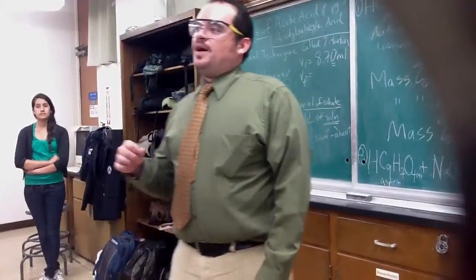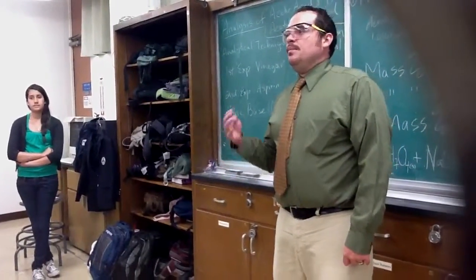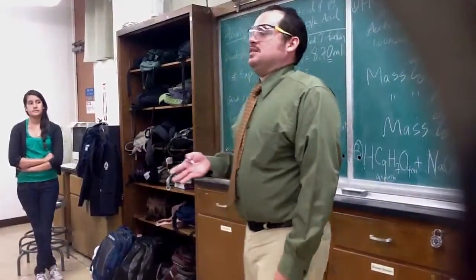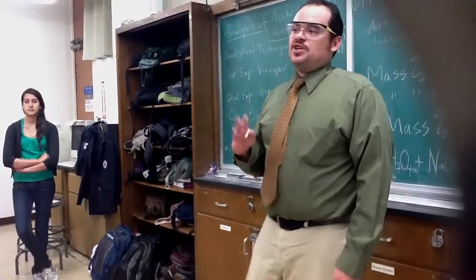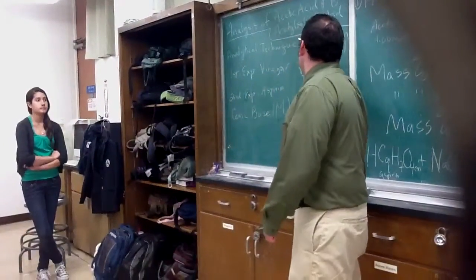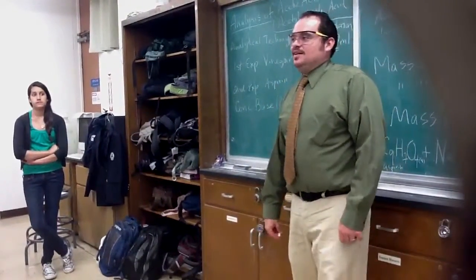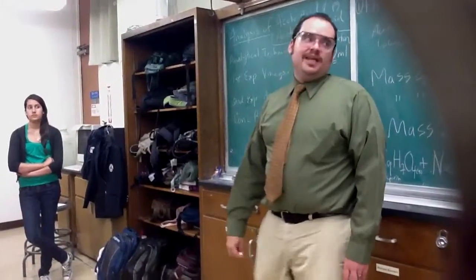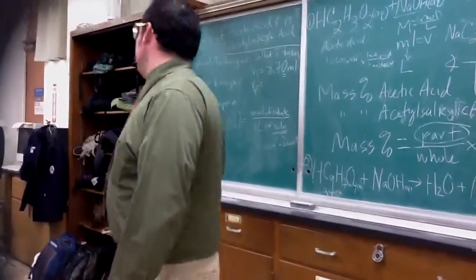Remember, these things are graduated to about 1/10 of a milliliter, so you can know that. But you can actually measure one more digit, which contains an uncertainty. It's the last digit, called the estimated digit. So make sure that when you take a measurement, you have at least 2 digits after the decimal point. Most of our students don't pay attention. When I see their data as I'm walking around, they only give me 1 after the decimal point. Make sure you have this in your data.